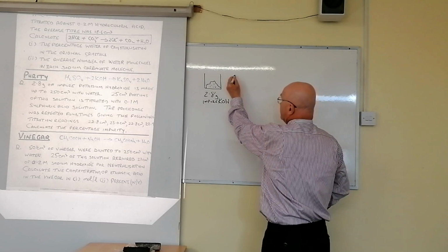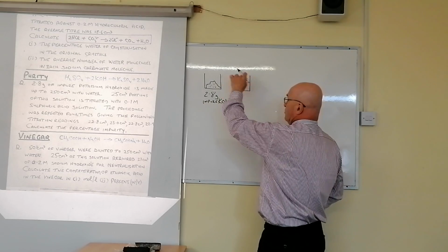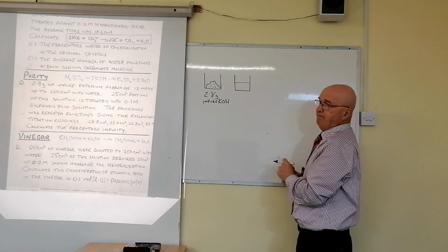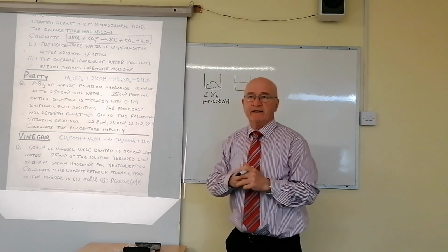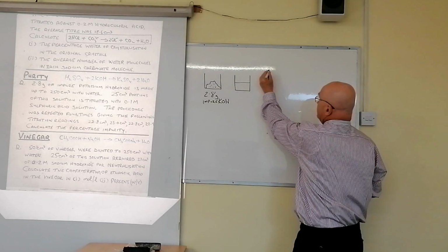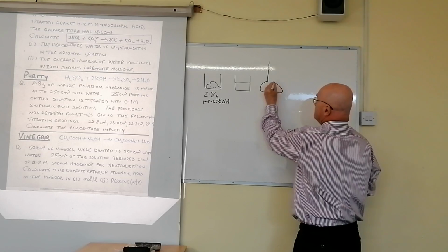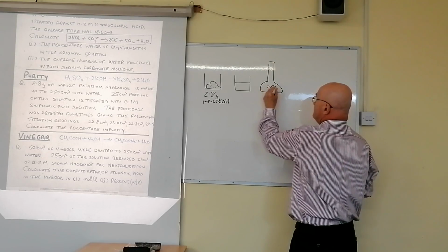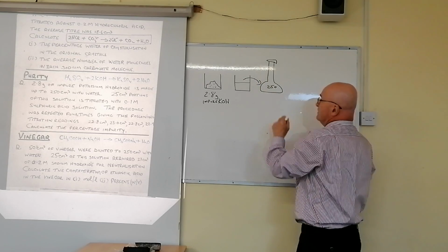And then you'd obviously dissolve that in water, deionized water, like that, okay? You pour water in there and you dissolve it. And then they've told you it's made up to 250 centimeters cubed. So obviously it's put into a volumetric flask. Now I've done this with you already, so I'm not too fussy about it other than I want to make sure you know what you're doing. That's a 250 volumetric flask, and that's put in here, right? And made up to the mark in the usual way.